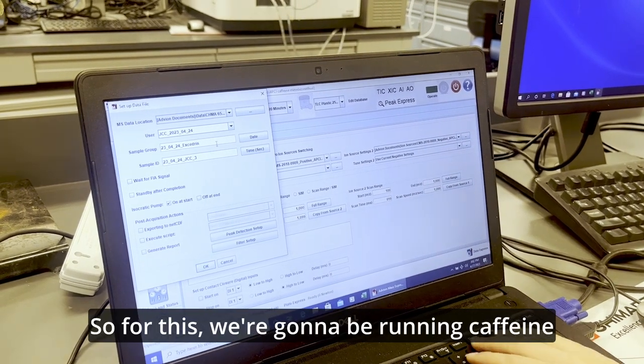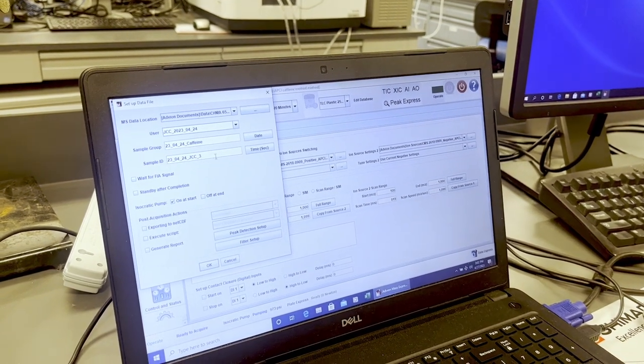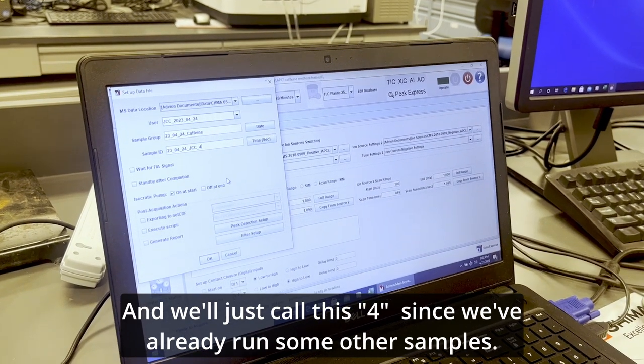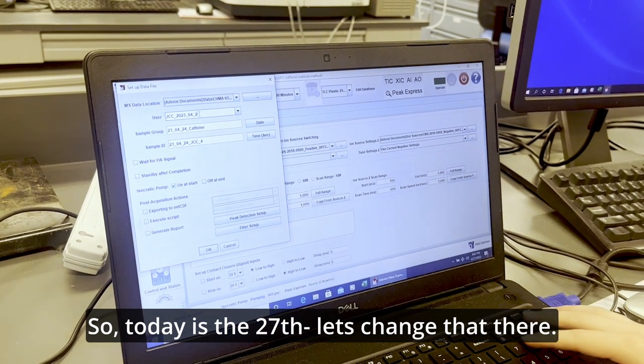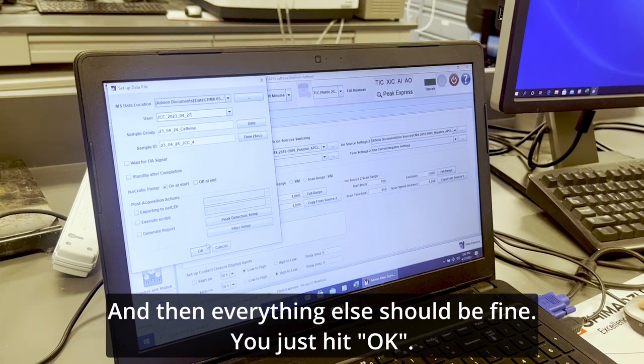So for this, we're going to be running caffeine. We'll just call this 4 since we've already run some other samples. So today is the 27th. Let's change that there. And then everything else should be fine. You just hit okay.